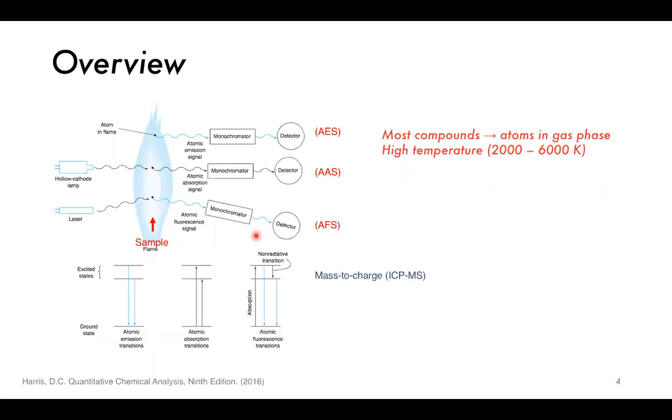So an overview. Generally, as I've said, there are the three processes: atomic absorption spectroscopy, atomic emission spectroscopy, and atomic fluorescence spectroscopy. So fluorescence is sort of stimulated emission. Emission is just, well, emission. And atomic absorption is whenever it absorbs the light in a manner which is very similar to our UV-Vis spectroscopy. So this is sort of like an overview of the three.